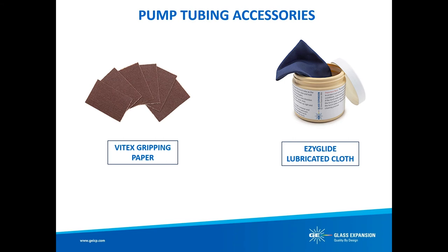Two accessories that help with peristaltic pump usage are Vitex gripping paper and EasyGlide lubricated cloth. Vitex gripping paper allows you to grip the smooth surface of the capillary tubing to fully insert it into the peristaltic pump tubing without crimping or creasing. It is well known that peristaltic pump tubing wears out over time. You can slow the rate of wear by lubricating the pump rollers with the EasyGlide cloth — this simple maintenance step improves precision, reduces drift, and extends the period between recalibrations.